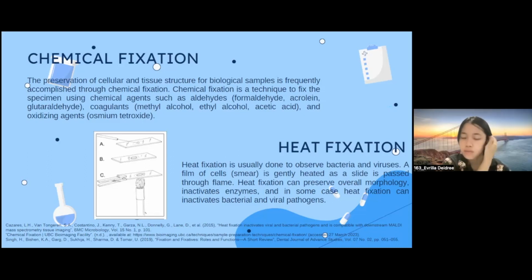Okay, I will continue. Heat fixation is usually done to observe bacteria and viruses. A film of cells is smeared and is gently heated as the slide is passed through the flame. Heat fixation can preserve the overall morphology of the cells and inactivate bacterial and viral pathogens.